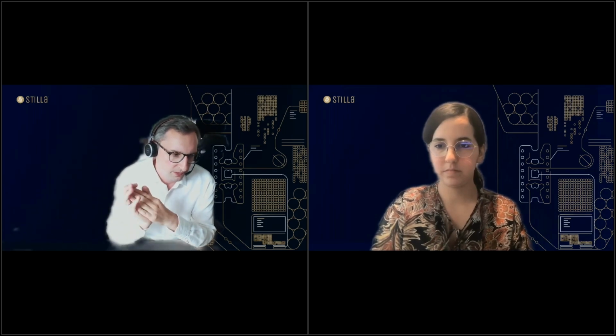They can work for a duplex competitive assay. As I said, two probes competing between wild type sequence and SNP sequence. They can be used for that, but the chance is very high that the MGBs are interfering with each other, and then you will have a very bad signal. This happened actually in my work at IPK back then, that we tried it with MGB and we had no resolution at all. It was just not binding at all. We had just no signal. This can happen, and this does not happen with LNAs. It's really up to you.